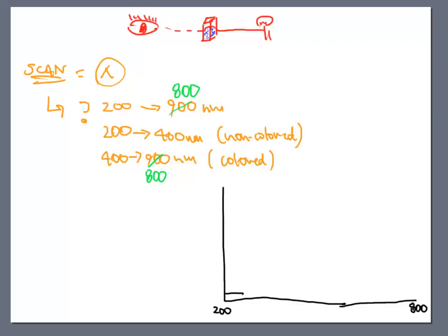So 200, 201, 202, 203, 204, 205, 206, it's going 1 nanometer at a time. And it's measuring things to see if it can get anything at all from the sample that you've introduced into it. Nothing so far. Well, what happens is that eventually, sooner or later, my sample will begin to react with the light and I see a big spike. So the machine knows that and it says, oh, wait a minute. I'm in the window here. I know what numbers that I'm getting something from the sample that you knew nothing about.